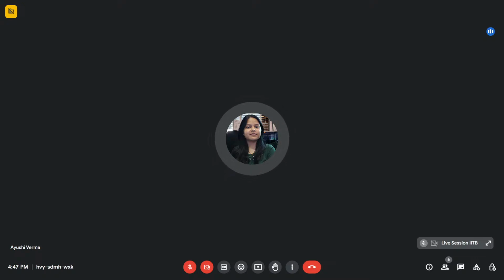So the autosampler will take 8 microliters automatically from the autosampler. Likewise, if you fill in the details and select whatever sample you want to run, you just press the button and you can start the analysis. So this is how you can plan the runs. And now I'll show you one run which is already done.